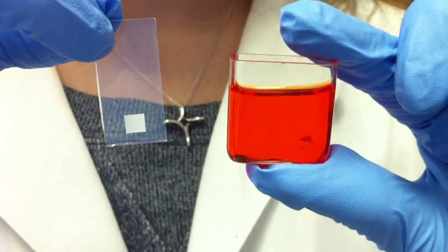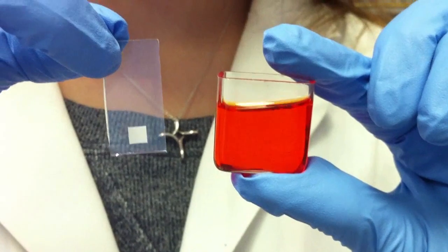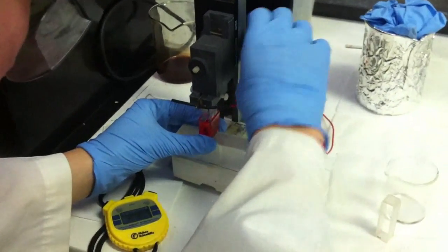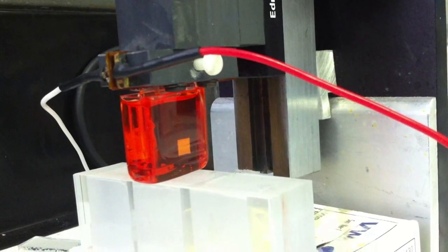Electrophoretic deposition allows us to deposit presynthesized colloidal quantum dots onto our photo anode. After submerging the electrode into the quantum dot solution, we use high voltage to drive the particles into the TiO2 network.